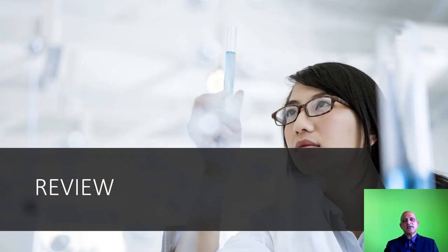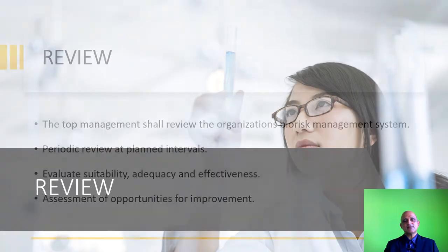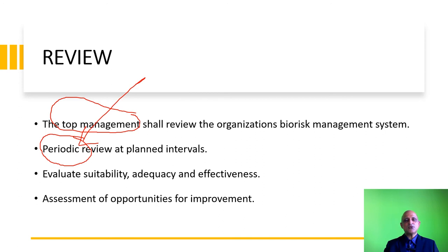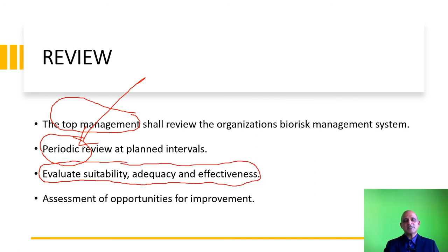We now move on to review of the process, which is part of your audit. The review is at the behest of top management and must be conducted periodically — generally an annual audit in which you call external and internal auditors to have an unbiased review of the system. Top management must evaluate the suitability, adequacy and effectiveness of the management system. If not satisfactory, it must be addressed and improved upon, and opportunities for improvement must be assessed.